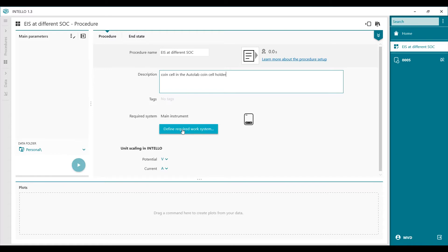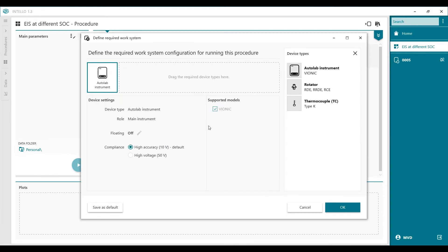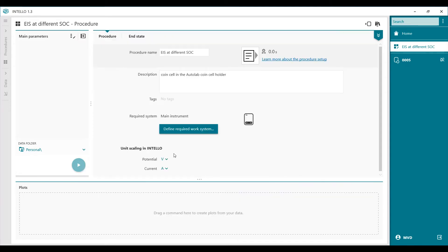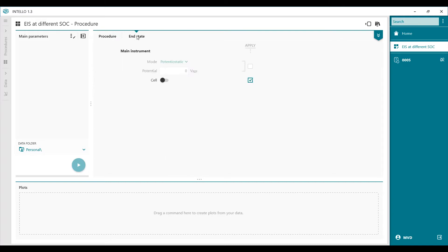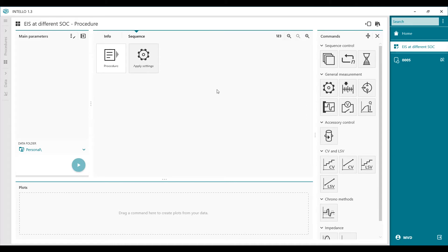Under main instrument we can define what we have. We set high accuracy mode at 10 volts because the coin cell won't exceed higher than 10 volts. Potential is in volts, current in amps — that's the definition. The instrument is set to switch the cell off at the end of the procedure. This procedure is named 'EIS at different state of charge.'